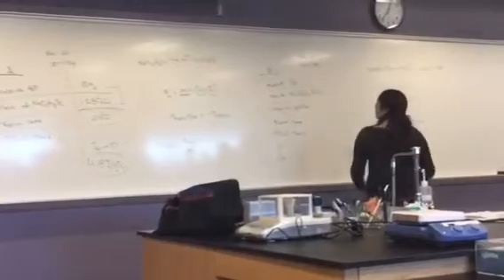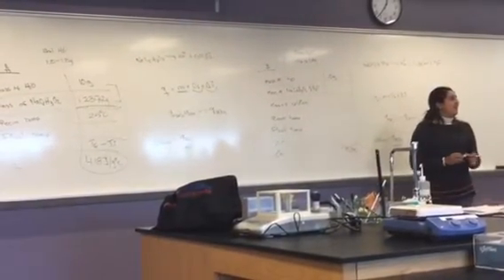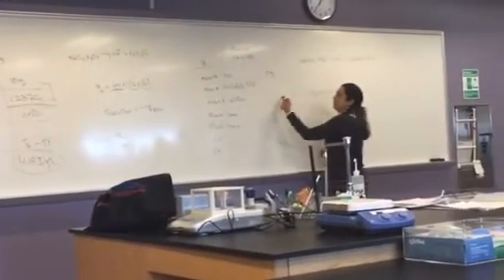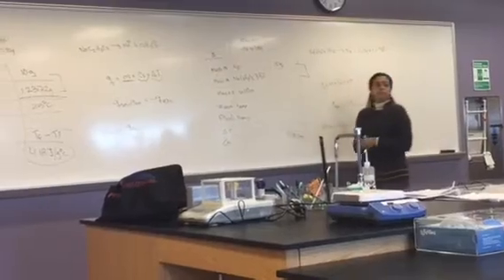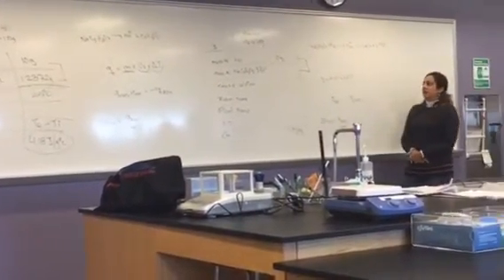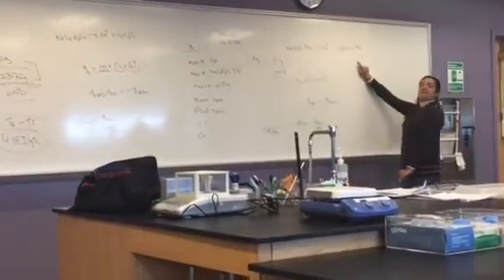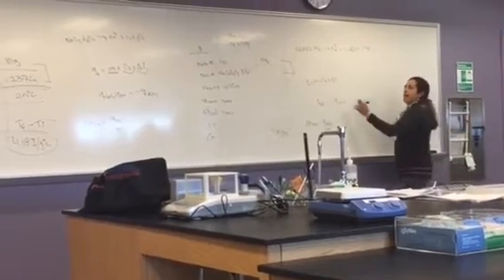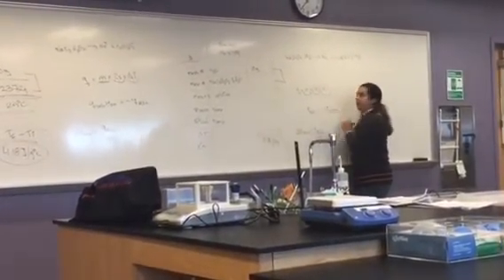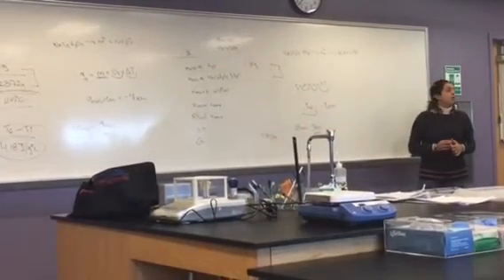You have the mass of water again. It's going to be 10 grams. The mass of sodium acetate trihydrate is important that you record. The mass of the solution is going to be this plus that. Room temperature, final temperature, delta T, and specific heat capacity. The reaction will be the dissociation of sodium acetate trihydrate. The mass of the solution we know, the specific heat capacity we know, delta T we know, and we use the same formula. Q of the solution equals negative Q of the reaction.